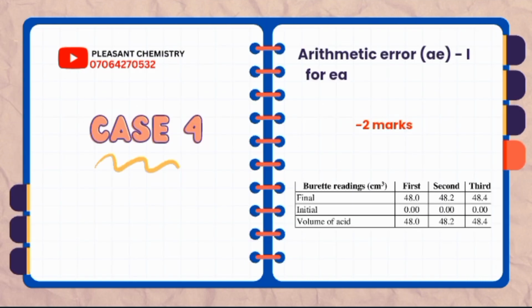Another error that students commit during titration is what we call arithmetic error. Arithmetic error will attract a penalty of -2 marks. What is the meaning of this arithmetic error? Now, you must subtract your initial Burette reading from the final in order to get the volume of acid used. The way the table is on the screen, that's how you are expected to draw your table.